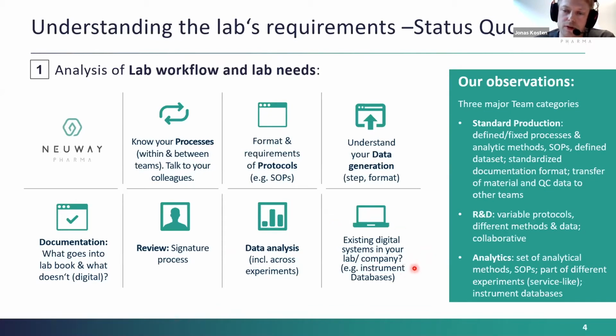What I also found is that many instruments nowadays come with their own databases, so you need to think about how to integrate those, or, if you have any other digital system like a LIMS, how you would integrate it into the whole workflow with the ELN.